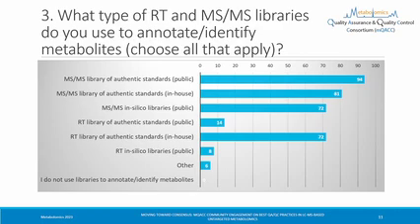But for retention time libraries, because LC columns, LC methods, solvents, gradient elutions, etc., all of those change, retention time libraries aren't necessarily transferable between different laboratories. And so there is the view, at least at the moment, that everybody's building up their own in-house retention time libraries. So there's a difference there between MSMS libraries and retention time libraries and how we construct and use those.